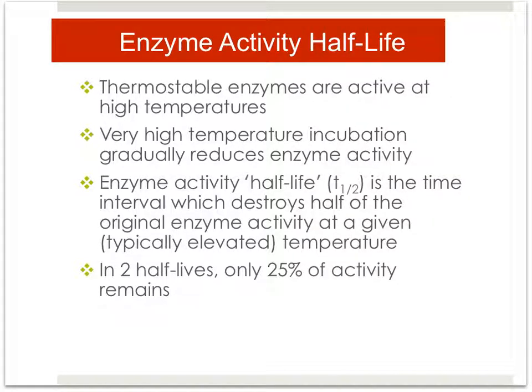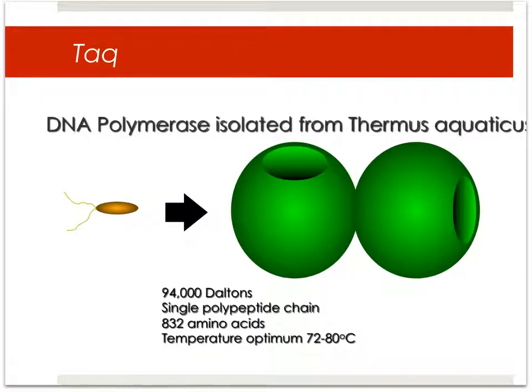There are various things you need to consider when you use enzymes, depending on your purpose, to make it a high fidelity, high accuracy, highly efficient PCR. You have different choices of Taq polymerase type enzymes. There are high fidelity versions and different considerations you need to make. The classical Taq is from Thermus aquaticus.